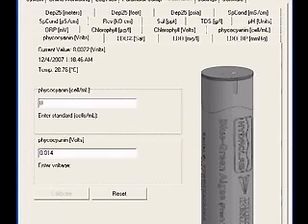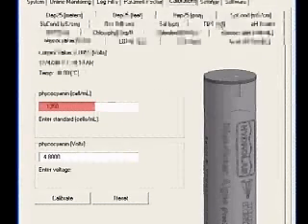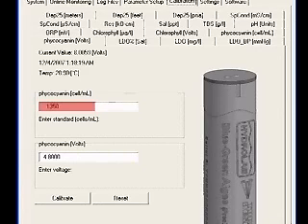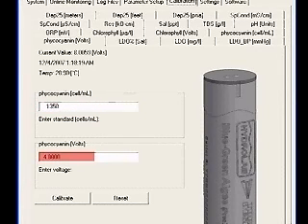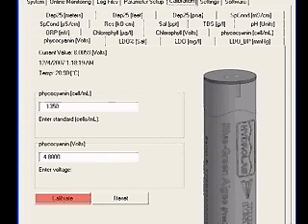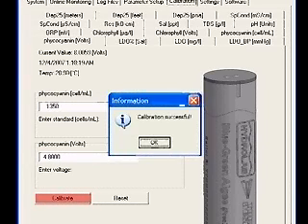Now type the extracted value into the box labeled Phycocyanin cells per milliliter or Phycoerythrin cells per milliliter. Type the voltage recorded from the sample before it was extracted into the box labeled Phycocyanin volts or Phycoerythrin volts. Click the Calibrate button. A calibration successful message will appear.